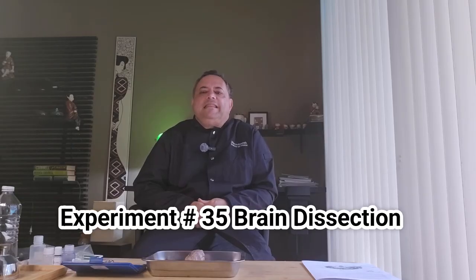In today's episode, we're going to look at the anatomy of the brain. I'm going to dissect a sheep's brain and illustrate and point out some important structures in the external anatomy and the internal anatomy. I produce video notes to accompany this video with all the science background.